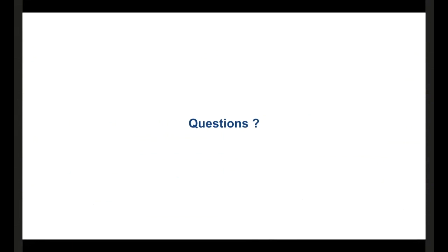But what I found was that the policy of where the data was and the users was quite different from one place to another. At least for these two cases, it was not easy to reuse or make it so general. It was complicating the code that much. So we have these as examples of how you can use the Scipion API just to kick off the processing and streaming. So far, there is not a general solution.